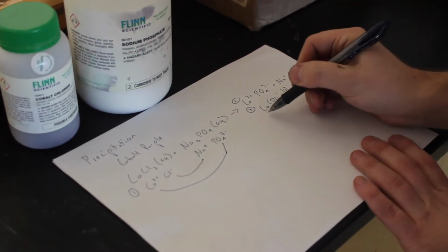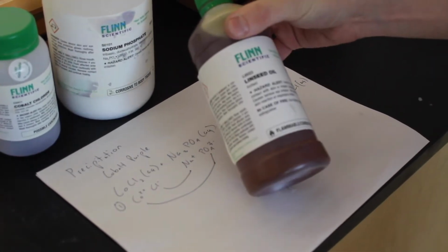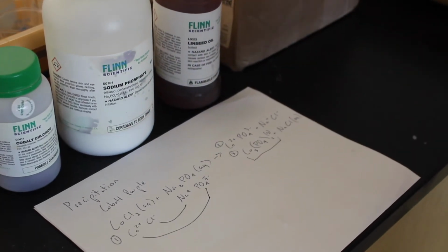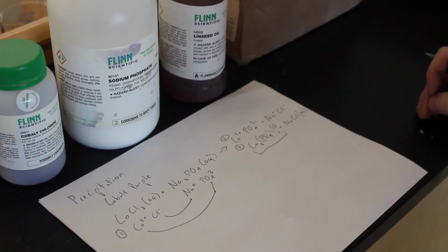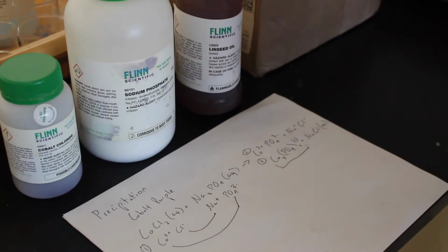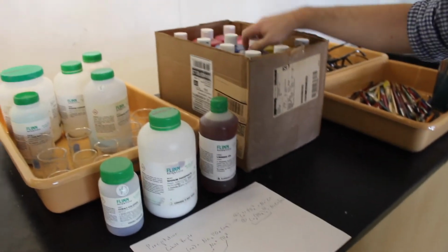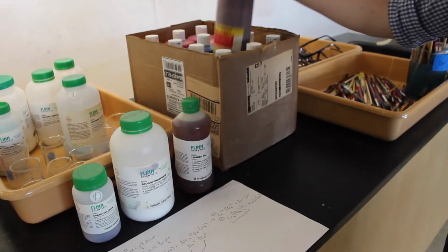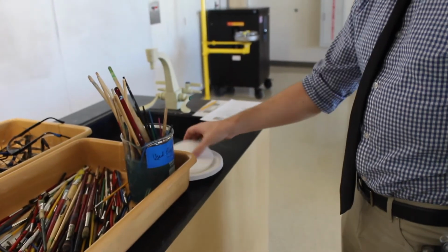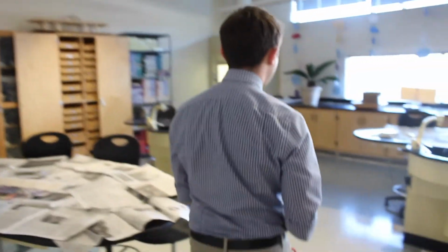So this compound is going to be solid purple, and if you dissolve it in something like linseed oil, or even if you just keep it in water, you suddenly have something you can paint with. You have to make one precipitate using these chemicals, and then we have a bunch of other regular paints that you can supplement with. Paintbrushes, filters if you want to get the water out of your paint. Come on over to our clay station.